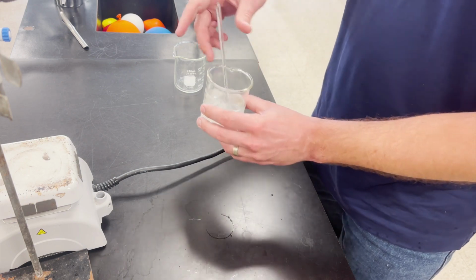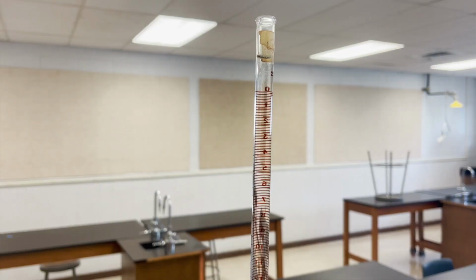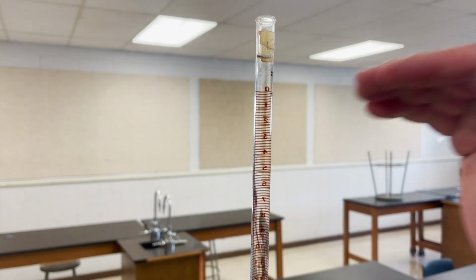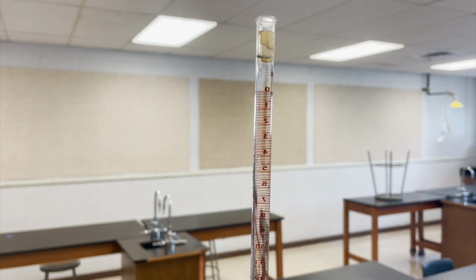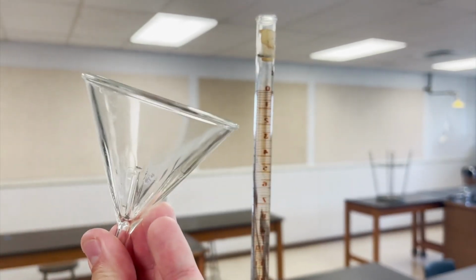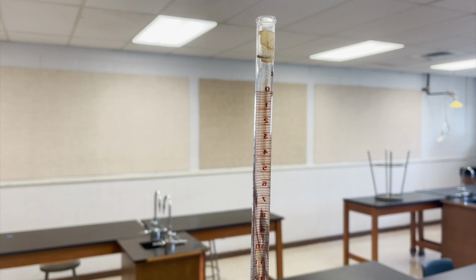So we're going to put this to the side for a moment, and then look at our burette. Right now, I've filled this up above the line there. I used my handy dandy funnel to put in the sodium hydroxide.